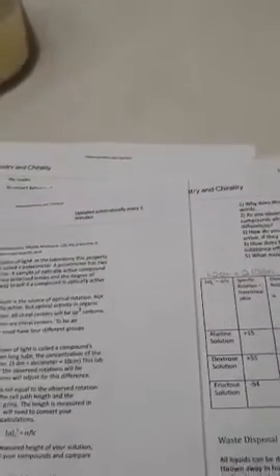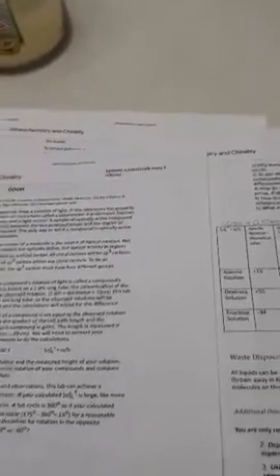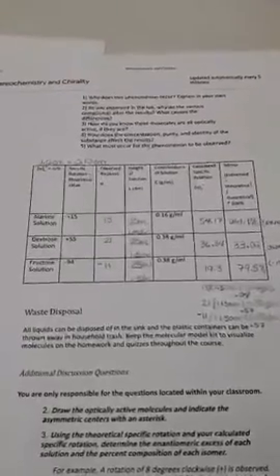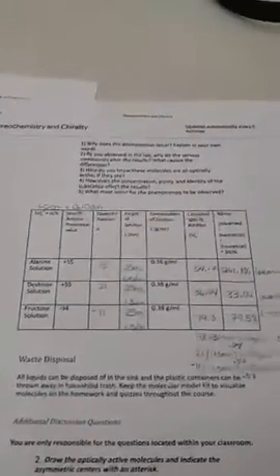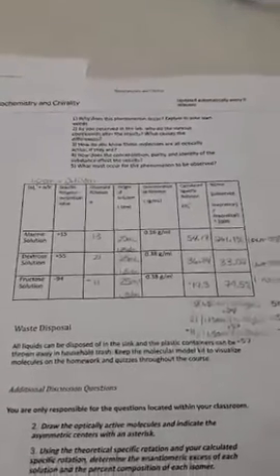This phenomenon occurs, that we can see the light, because we have sp3 carbons on our chiral centers, and it's an optical rotation. So that's why we can get our different angles. The various compounds alter the results because they're made with different compounds.